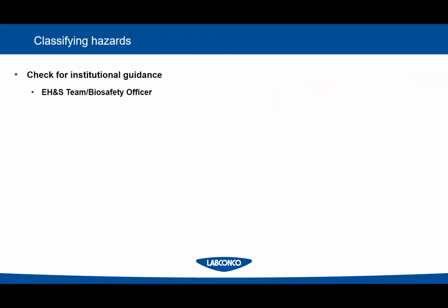So how do we classify these various hazards, be it powder, bacterial, viral? Anytime I go anywhere and somebody asks me, what do I do with this? I can point you to the government guides that are out there. It's always important to work with the in-house EH&S team, biosafety officer, whatever is on campus to help with those resources, because they're really the ones that take the bait for what's happening on campus, what they need to use, right? And I think here at my work, biosafety cabinets fall under a little bit different realm. So forgive me for that one, but that's typically how that goes.